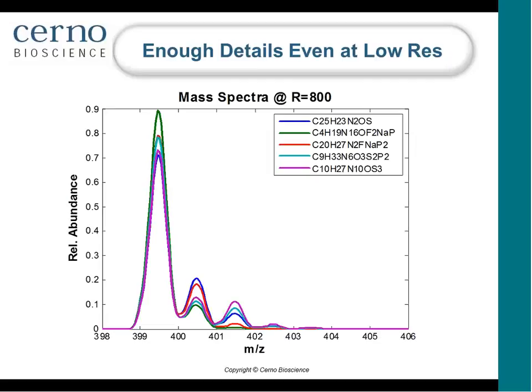But spectrally speaking, as you can see through the spectral overlay, they're very different. On the A+1, we have a mass spectral response that faithfully represents the contribution from carbon-13, sulfur-33, nitrogen-15, and hydrogen-2, and so on and so forth, so that if it's a different elemental composition, it will have a different profile. If we can analyze and process the mass spectral data in the raw scan profile mode.